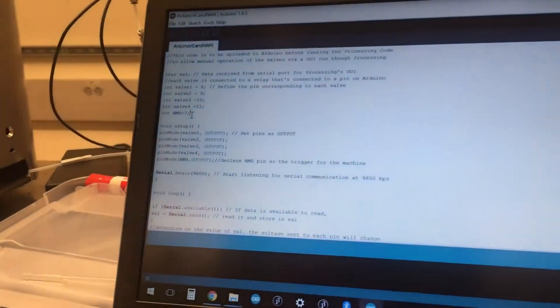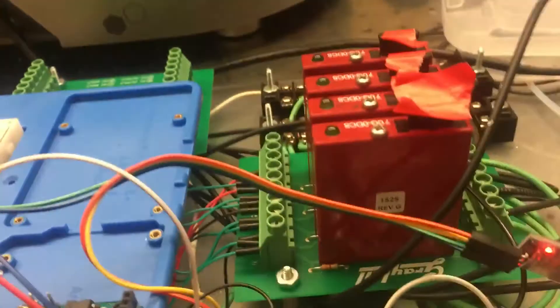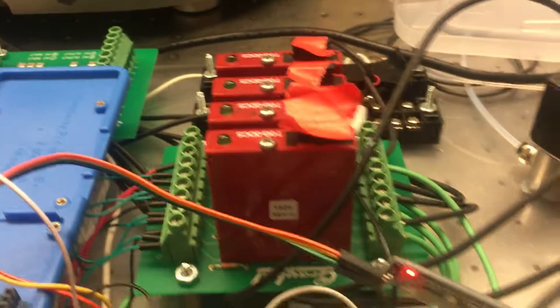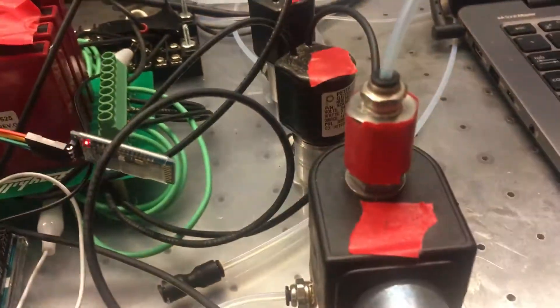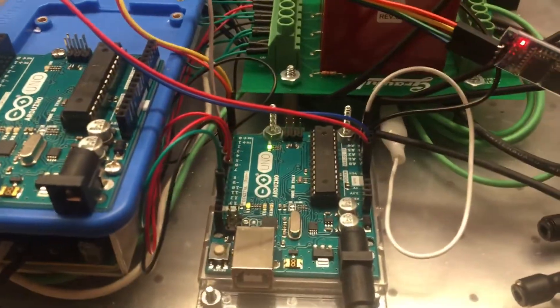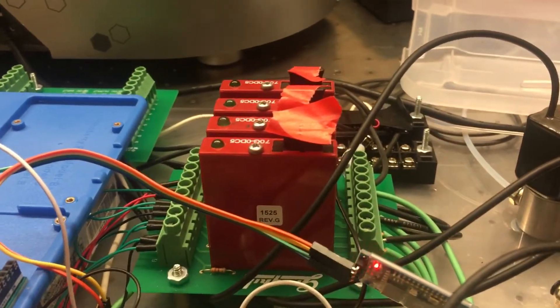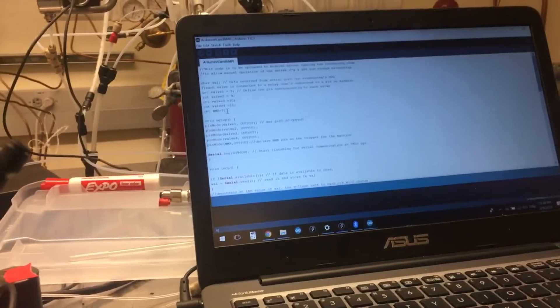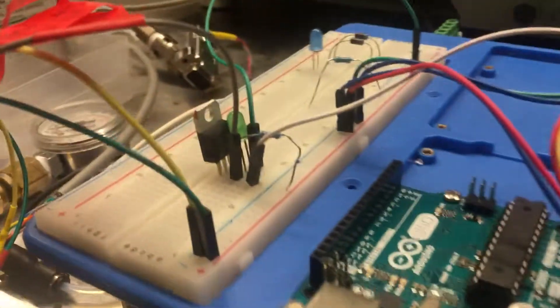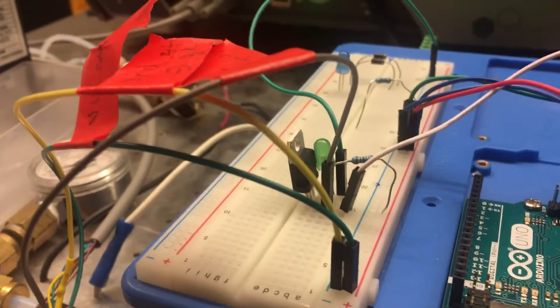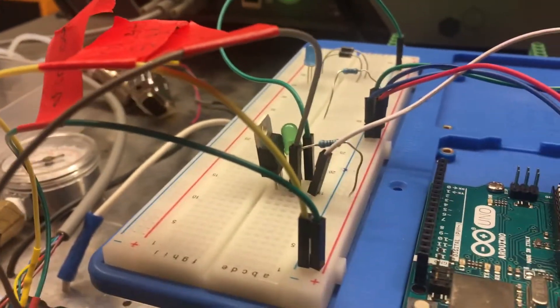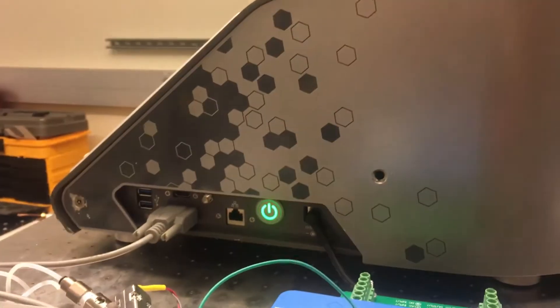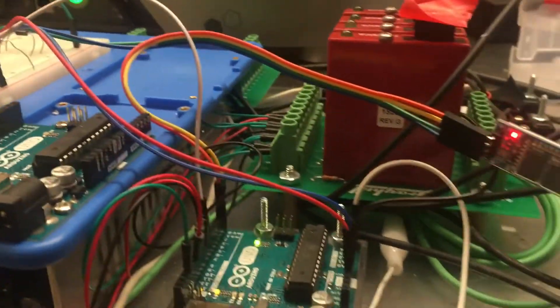The way we can see if the valves are on are based on these relays, because the valves operate on a 24-volt circuit and the Arduino operates on a 5-volt circuit, so we've got these relays as a bridge between the two circuits. When we check if the NMR trigger has been sent, this green LED here will light up as a falling edge trigger is sent to the NMR machine over the serial cable there, to cause a spectra acquisition to occur.